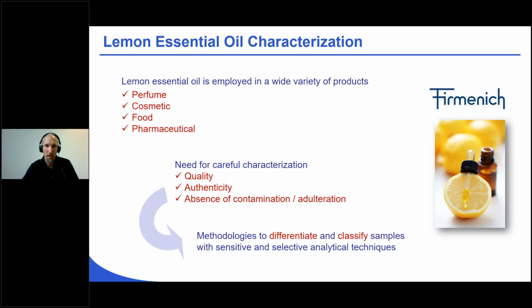they use. So for that, they wanted to see how useful metabolomics profiles could be to get maybe more insight into the chemical complexity of their samples, and maybe to detect contamination, adulteration, or things like that related to the quality of their products.